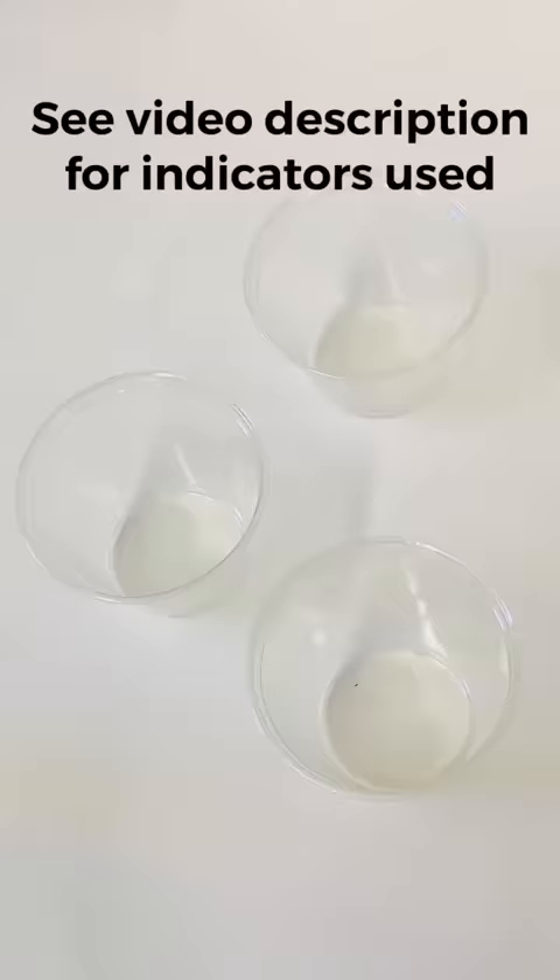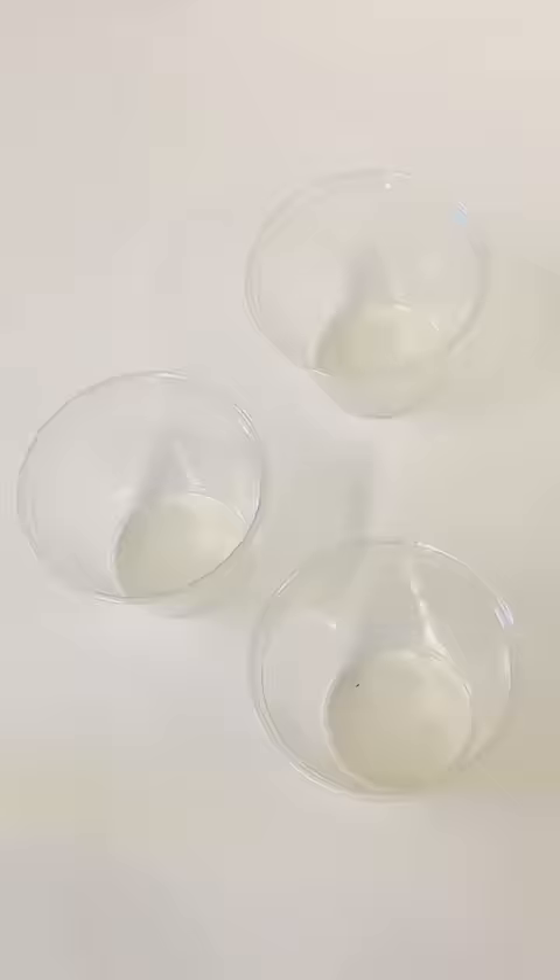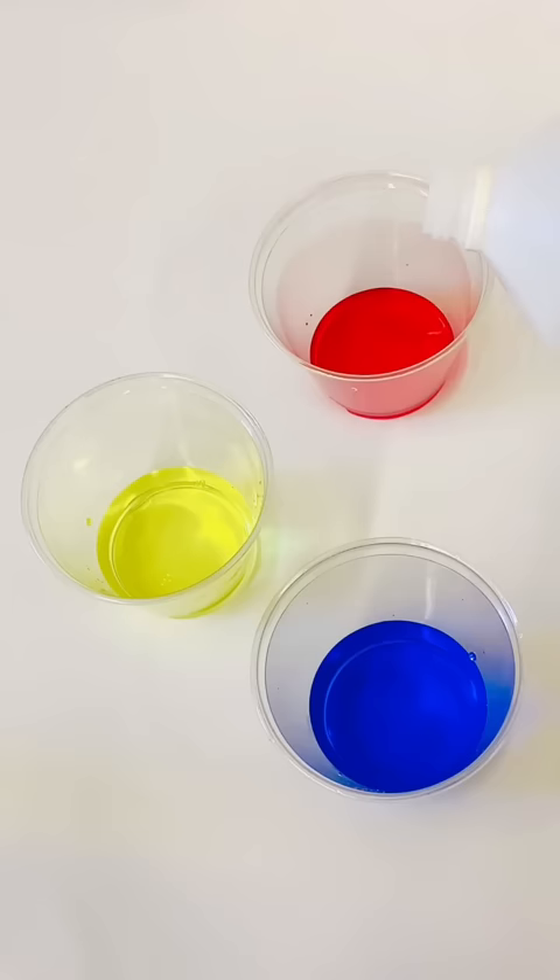Next, you prepare three cups with acid-base indicator. The first one gets red, the second one gets yellow, and the last one gets blue. Watch what happens when I add sodium hydroxide base to the indicators, which all appear colorless at first — the colors appear. And if I add some acid instead, they go back to colorless.